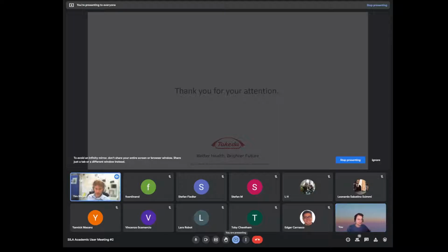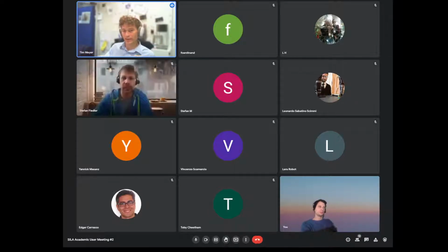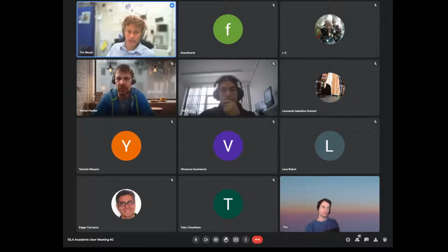I definitely want to join the other work group as well, because it's quite interesting. I do have quite some questions, especially about the latencies. We had a simulation when we thought about, for example, whether the robotic arm and the end effector should be two different SiLA devices or should act as one SiLA device. And then we were always worried that the latency of the SiLA communication is too slow if you have very tight connections.